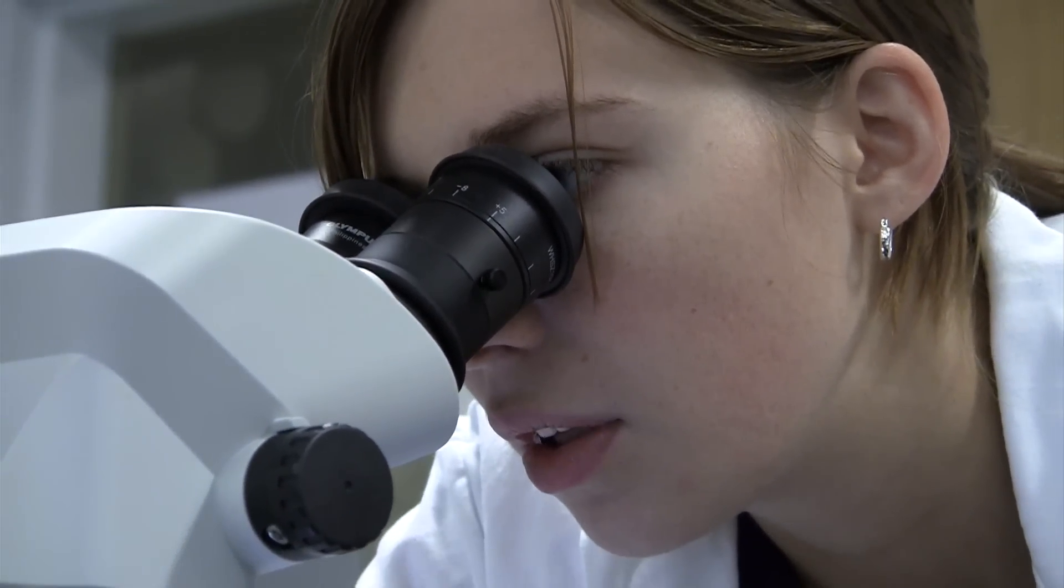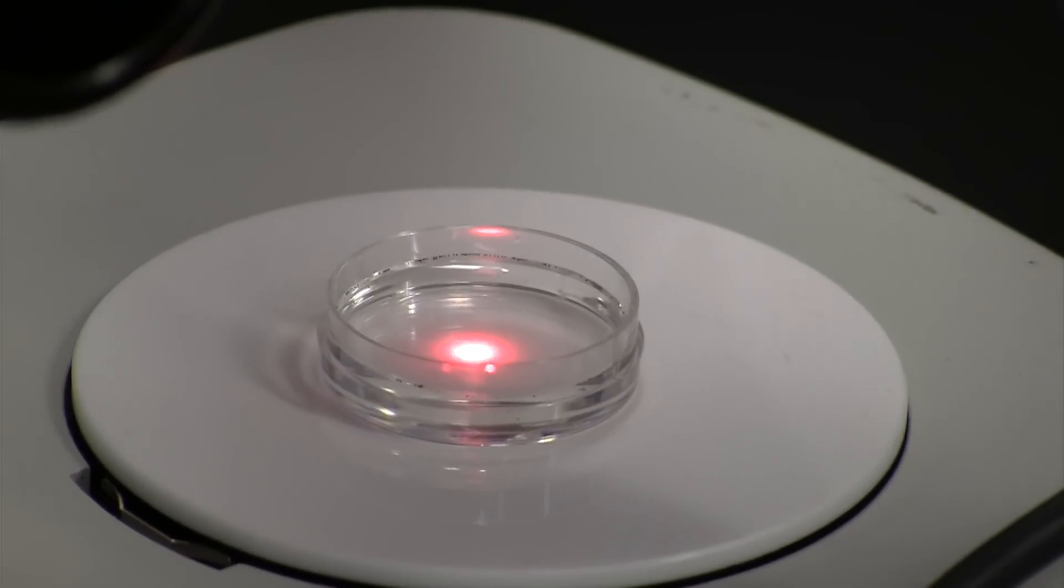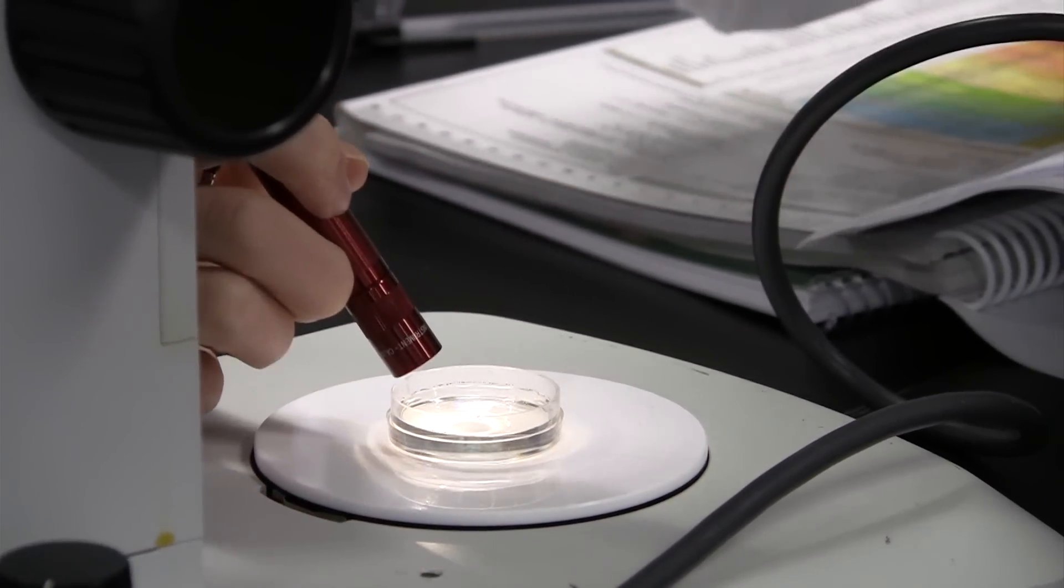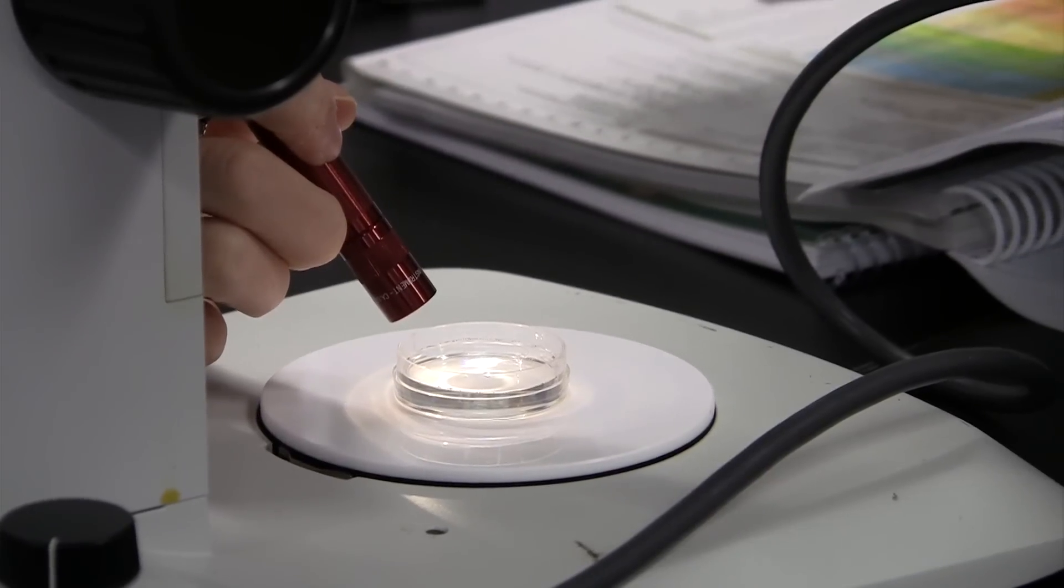They can test things like salinity of the water, the temperature of the water, so we have cold and room temperature. And we did have adult brine shrimp and nauplii, which are the baby form, but we altered it to just work with the infant stage.